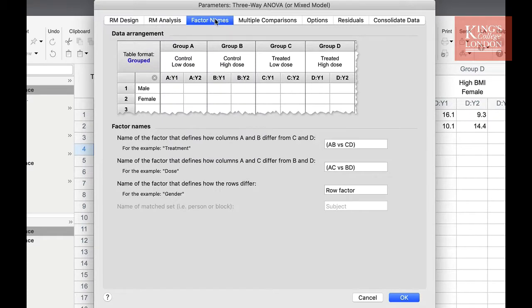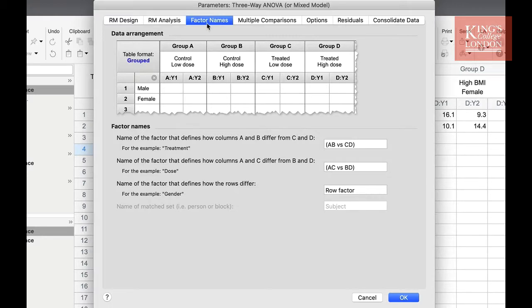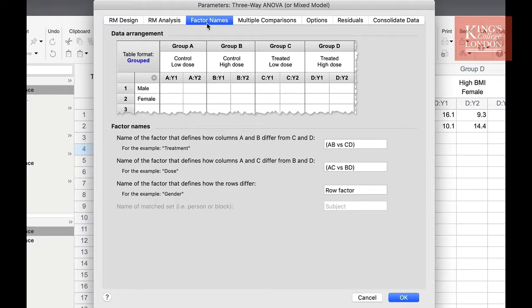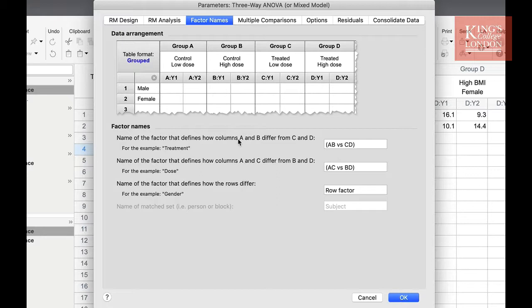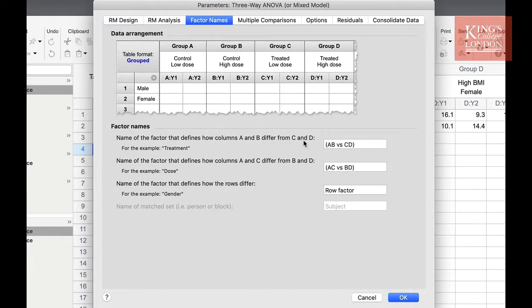We have organized our data so the low BMI numbers are in group A and B, with male in A and female in B, and the high BMI data are in group C and D, with male in C and female in D. Our rows are whether they are low or high smokers. Therefore, we must name our factors accordingly. The first box asks us to name the factor that defines how columns A and B differ from C and D. In the example we are doing here, A and B are both low BMI and C and D are both high BMI. So rather than AB versus CD, we enter low versus high BMI.